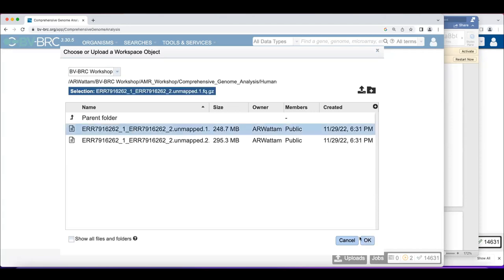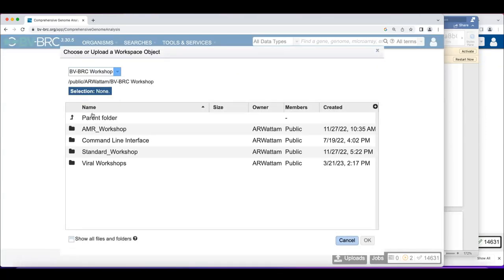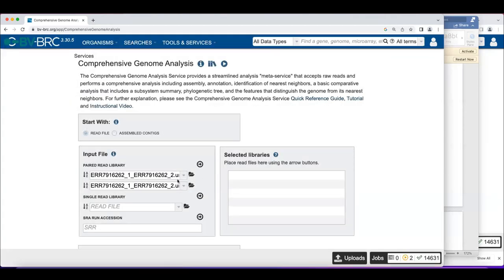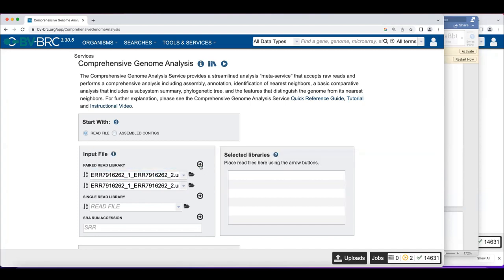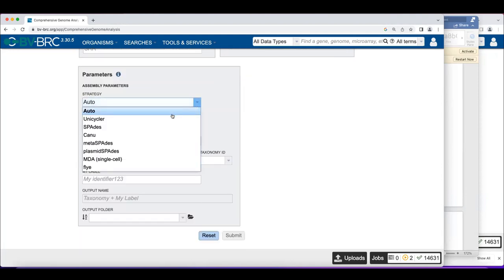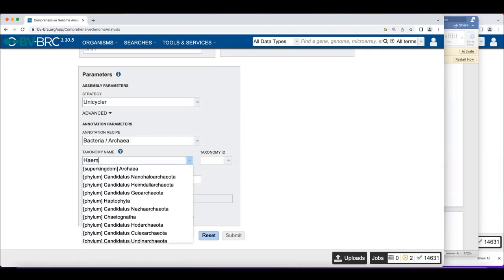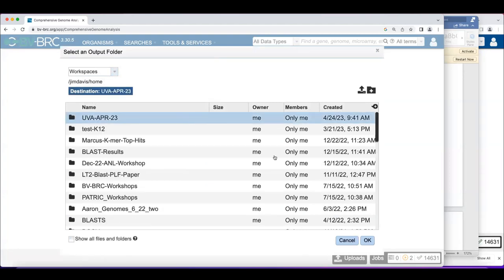In the BV-BRC workspace under AMR workshop / comprehensive genome analysis / human, we have unmapped_1 and unmapped_2. I'll select unmapped_1 and click OK — that's the first pair. Then I'll select unmapped_2 for the second. People always ask whether pair 1 or pair 2 needs to go in a specific slot — the answer is no, it's smart enough to know they're pairs. Then I push them over into the right-hand box, select Unicycler, choose the bacterial annotation recipe, name it 'h_flu_non-human', and put it in the output directory.